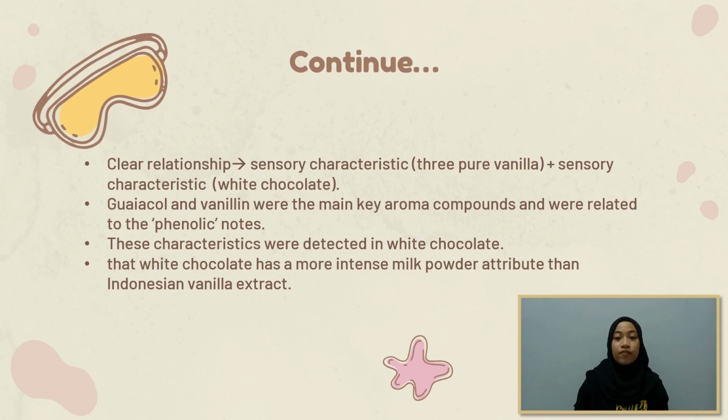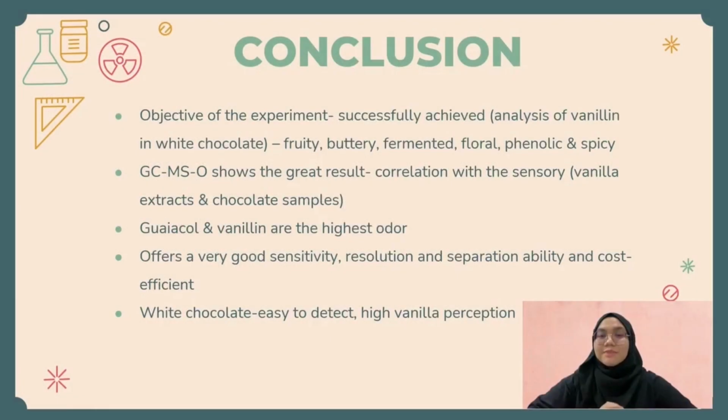The panel discovered the white chocolate has a more intense milk powder attribute than Indonesian vanilla extract. The last part for this experiment is the conclusion. To sum up, the main objective for this experiment has been successfully achieved, which is to analyze the vanillin in white chocolate by gas chromatography method.